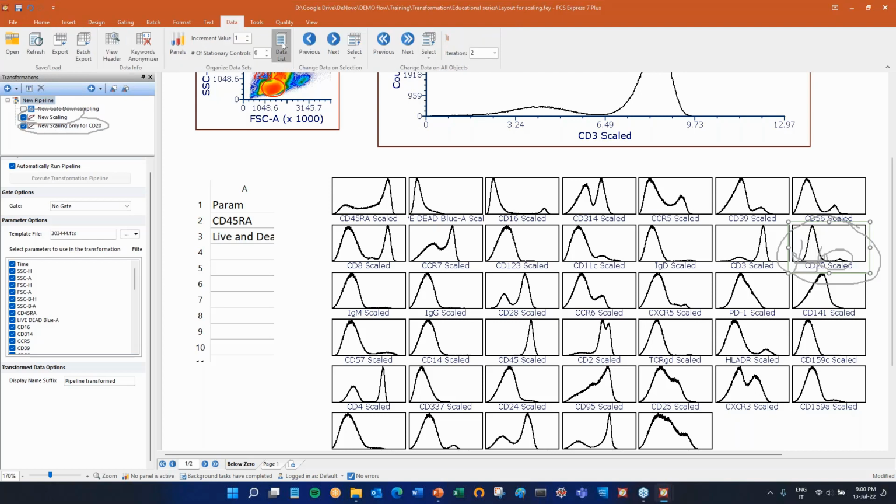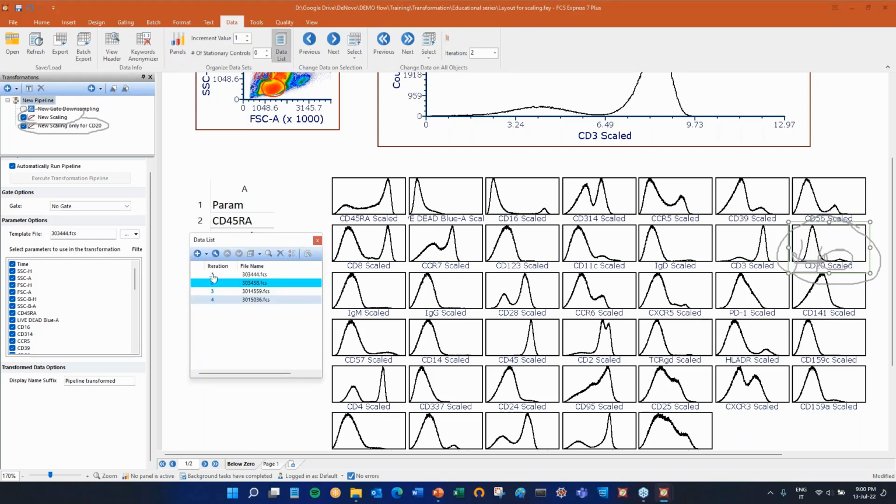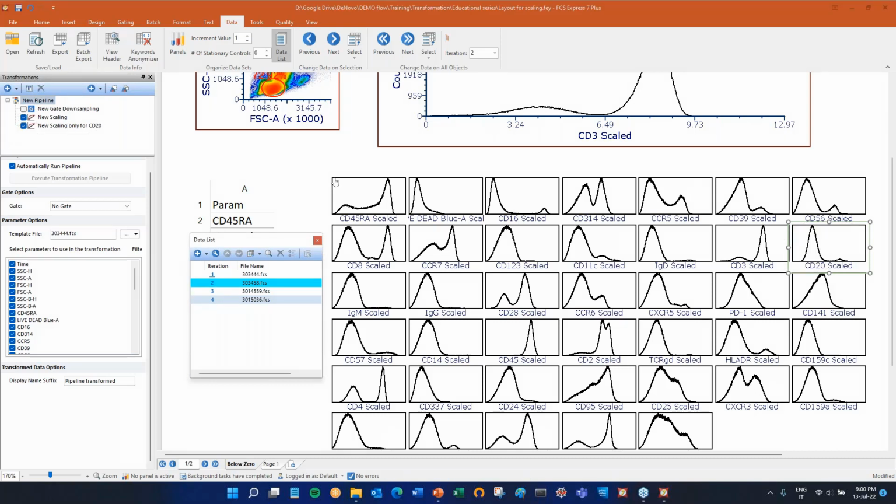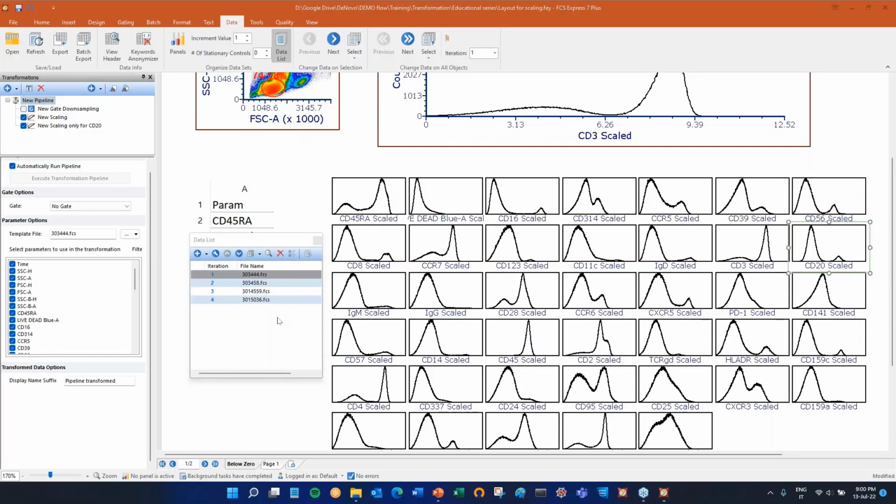Is this okay for every other file? Let's see file 1. Now file 1 is being loaded. Here we go. It's fine. So most of the time, you will not need to manually adjust any parameter, but it's useful to know that you can do that.